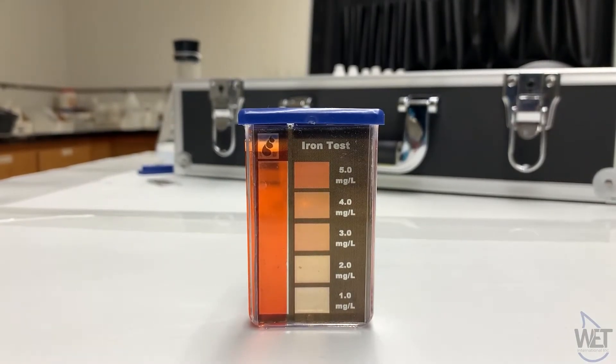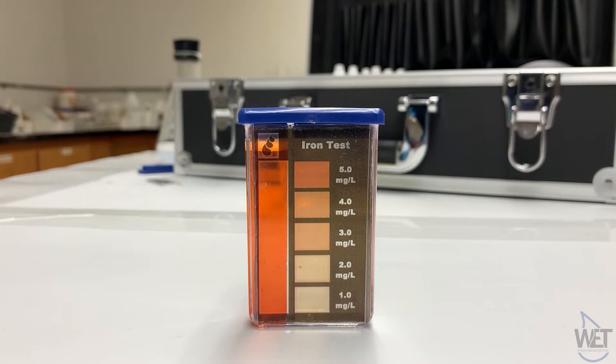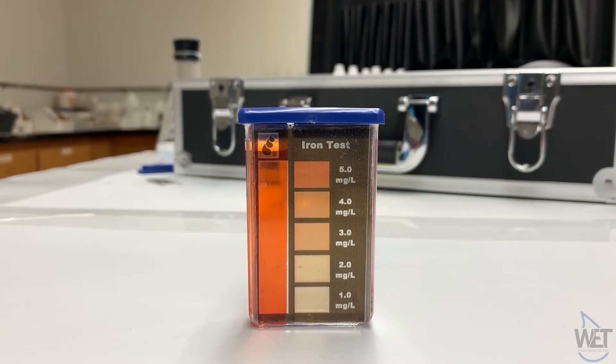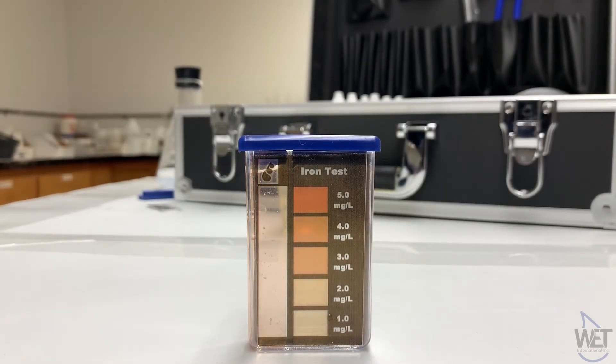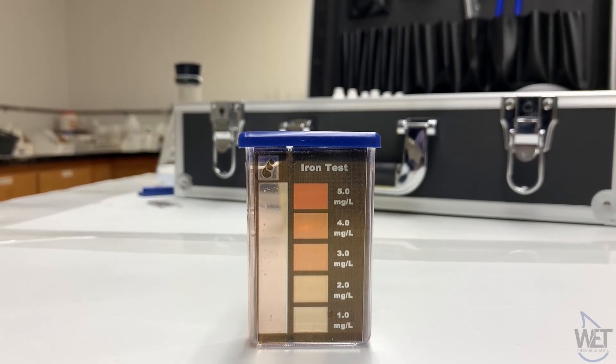This is a very positive sample for containing iron, and as you can see, it probably has over five milligrams per liter. And as you can see, for this sample, it is much less concentrated, probably closer to one milligram per liter.